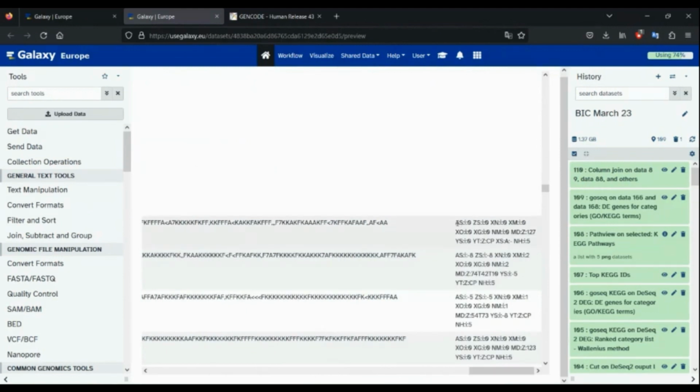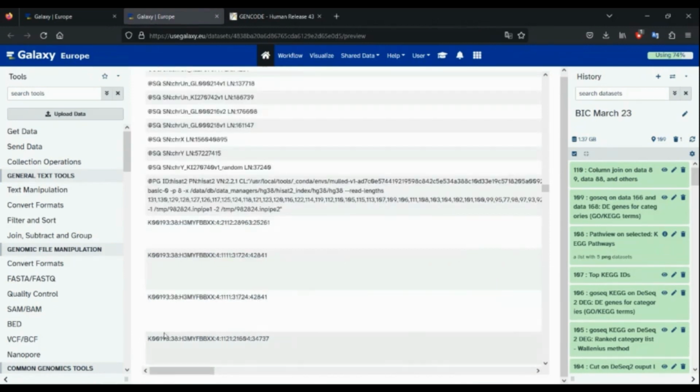And then you have a set of other things that, if you're interested, you can look up, because the SAM and BAM tools have a whole lot of information. It's very comprehensive. It has details on what all this output means. Generally, when we're doing this kind of analysis, you're not really bothered with the type of output. You don't exactly need to go through all of this in detail, but if it's something you would like to do, of course, you can always go ahead and look into it.